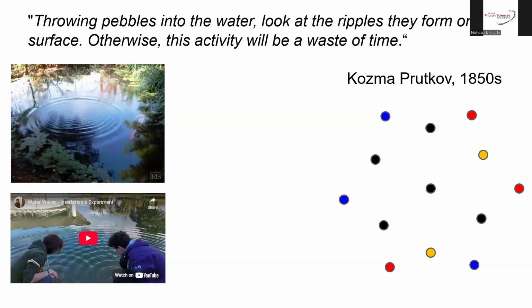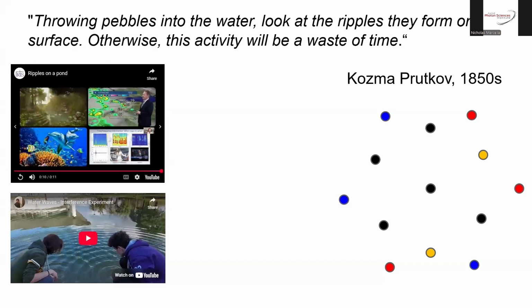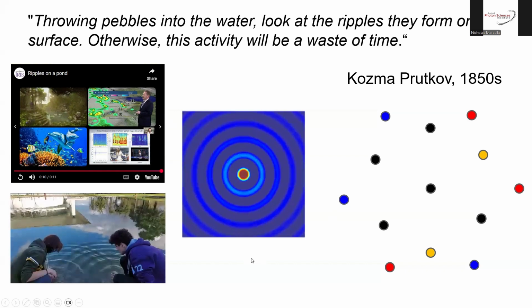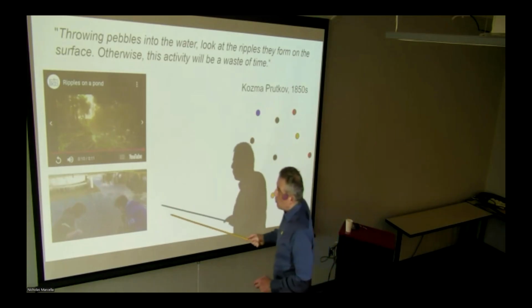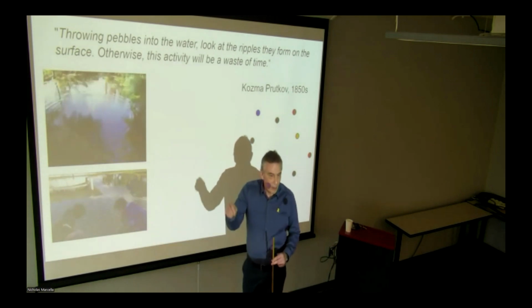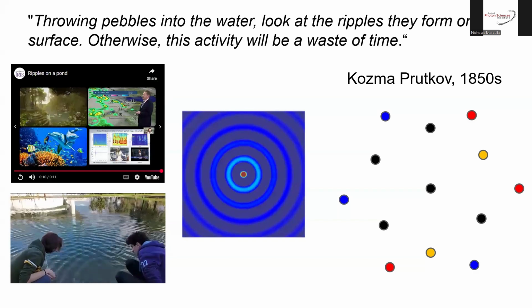And this is a simple example of a photoelectron that is excited. If you think of this as an inspiration to better understand X-ray absorption spectroscopy, it's only one part of it. The second part comes from the presence of neighbors around the X-ray absorbing atom. So there are two people exciting the wave interference by doing this, right? And you can see that if you want to use it as a structural tool, and you change the frequency of this periodic motion, then the interference pattern will change. It will be a different wavelength, different distances to the maxima and minima.